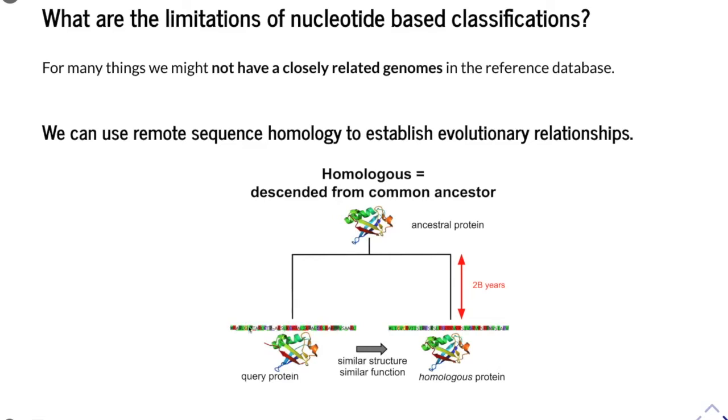You see that only by looking at the colors, meaning there are different biochemical properties, that these sequences have changed over time, but the structure stays the same. But some patterns in the sequence are actually still conserved. So you have this red block here, for example. And these protein search methods actually have the possibility to pick up even diverged signals like that. So you can still find connections that are really far away.